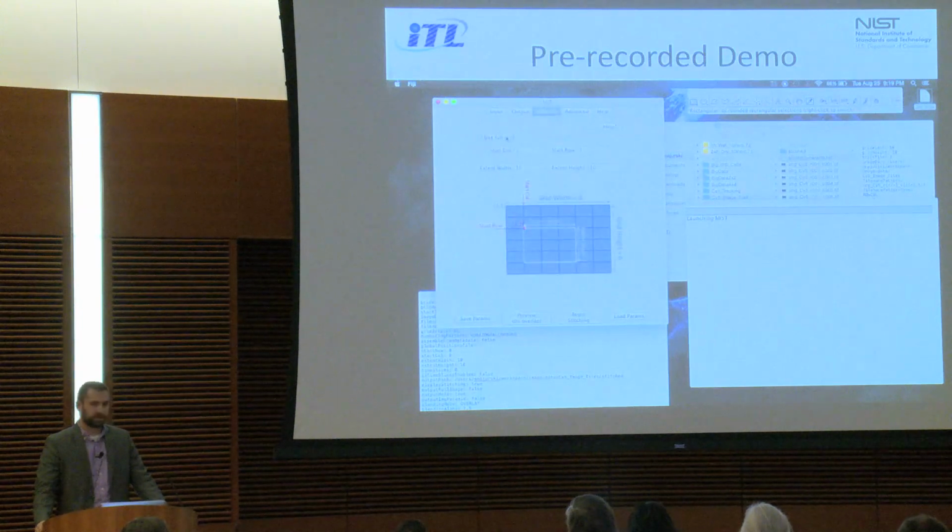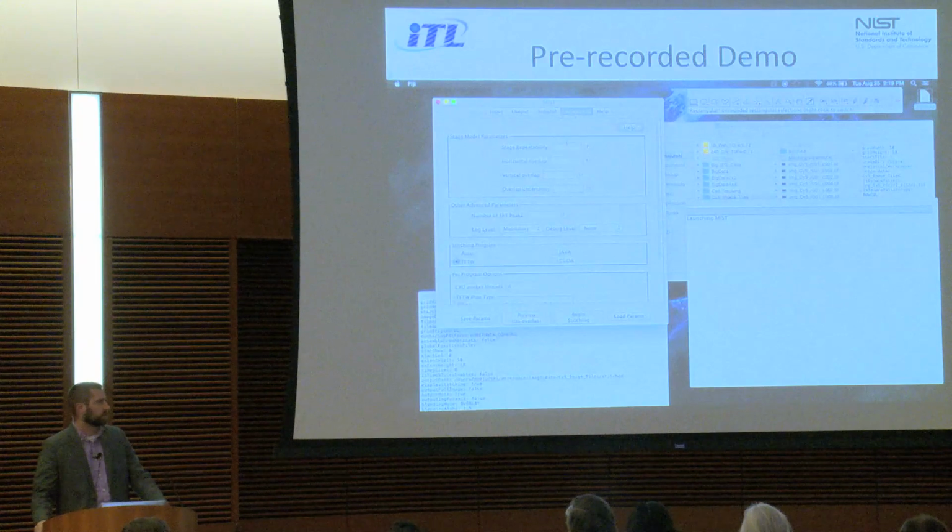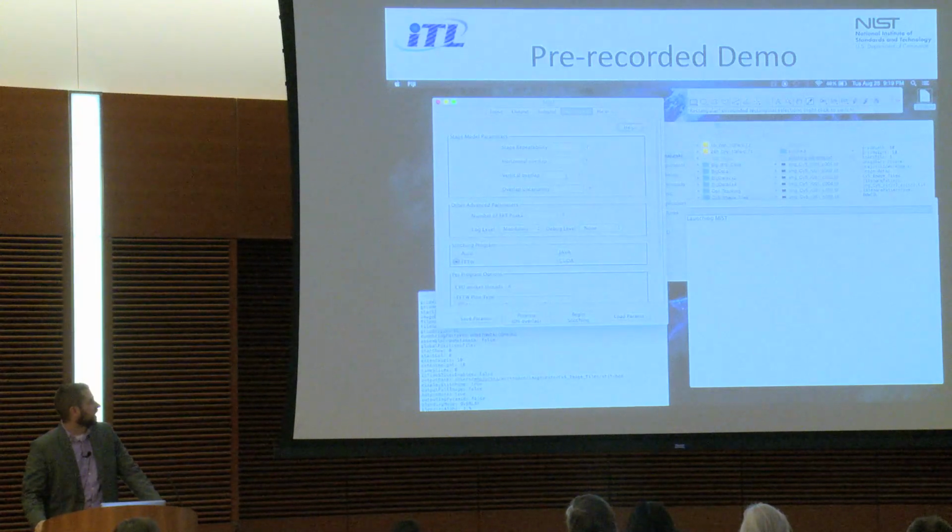Check the subgrid because you can stitch just subgrids of the image instead of doing the full thing. You can do a test 5x5 to see if you've got the parameters right. And then you want to check the advanced tabs. I'm here just making sure there's nothing extra there, the default values only. And then we're ready to go. So we go down there and click Begin Stitching.